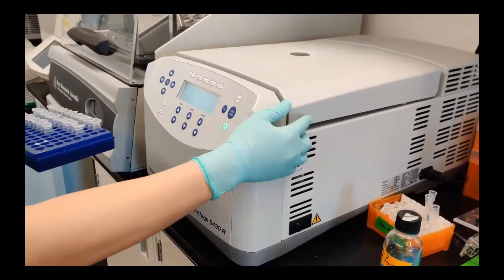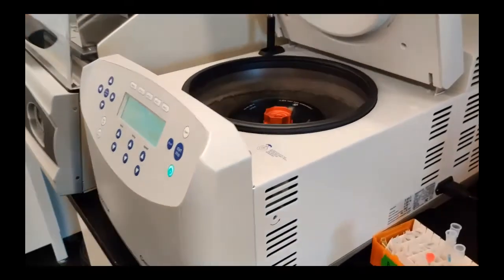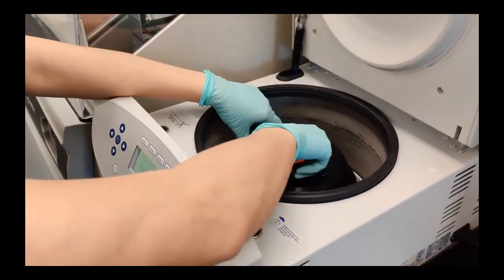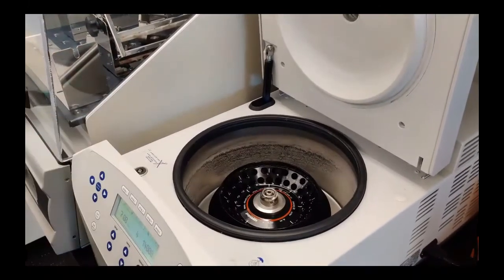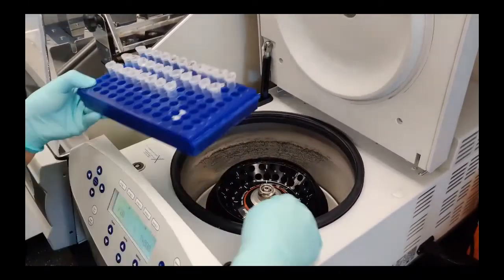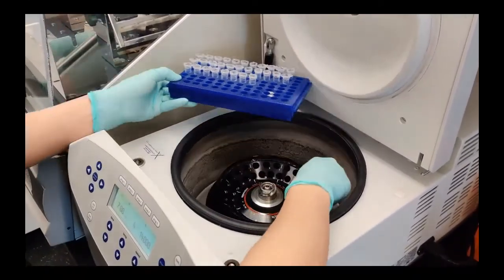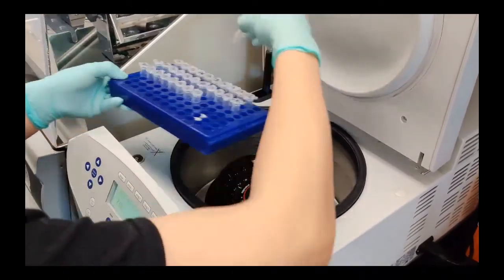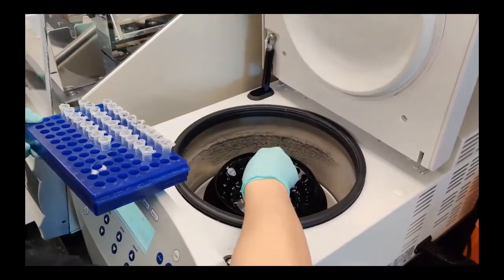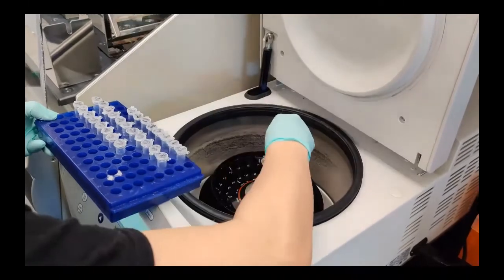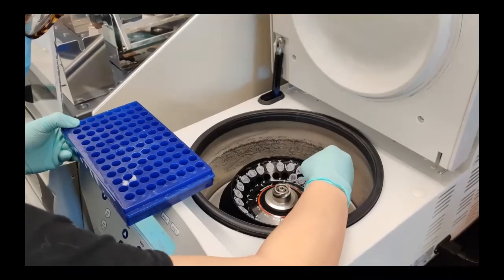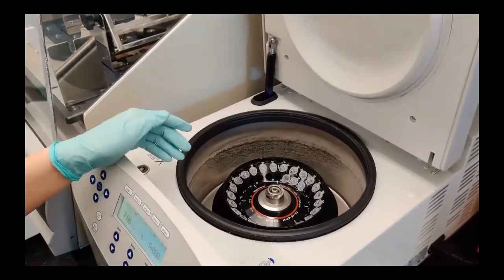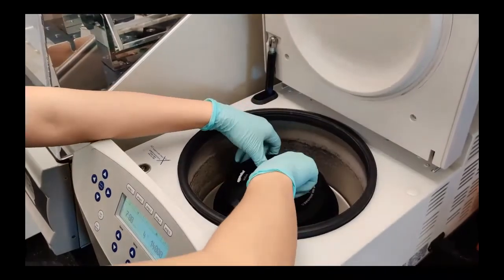Next, we spin the samples very fast in a machine called a centrifuge to collect any condensation on the sides of the tubes. Here, we're putting the samples inside the centrifuge. All the samples are now inside the centrifuge. Now, let's close it up and get it started!